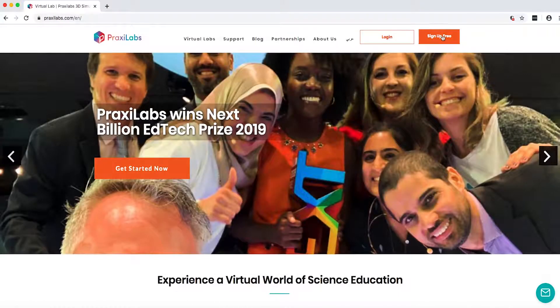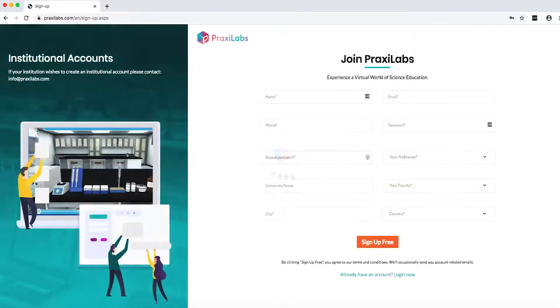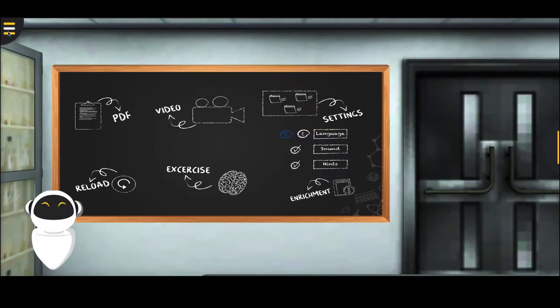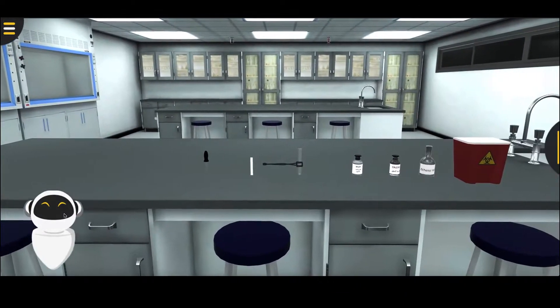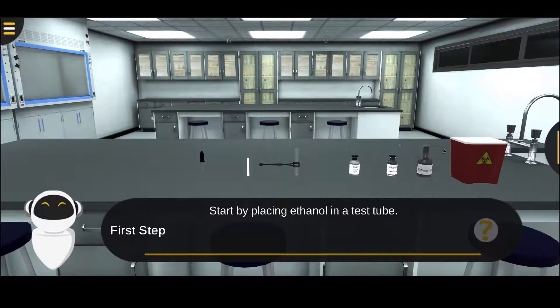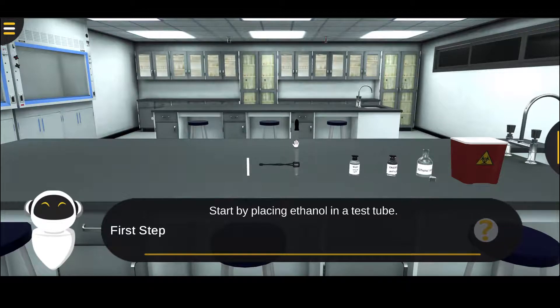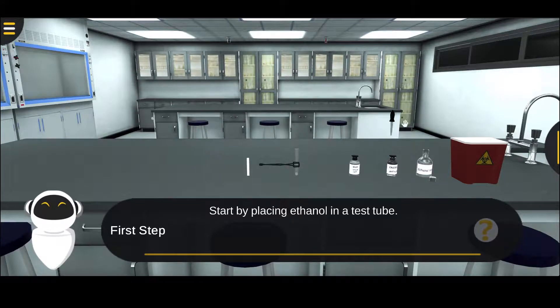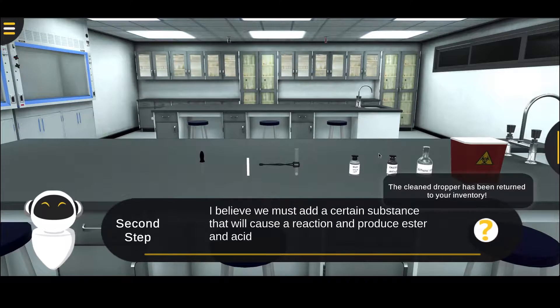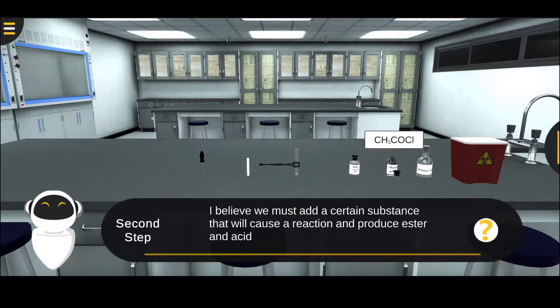Now start the experiment at the virtual chemistry lab of Praxylabs. Step one: begin by placing a small amount of ethanol in a test tube. Step two: add a substance that reacts with ethanol to produce hydrogen chloride gas and ester. In this experiment, we'll use acetyl chloride.